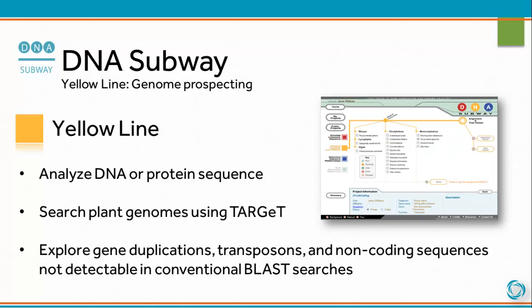The yellow line is for genome prospecting. Use the yellow line to analyze DNA or protein sequence, search plant genomes using TARGET, and explore gene duplications and transposons.